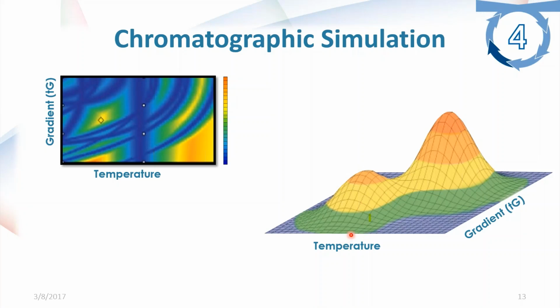Now, if you were doing method development in a linear fashion, so say we started at a particular temperature and we went up the gradient, you could find that, okay, now the separation's starting to improve, and you could optimize the temperature and end up in an area where there's a local maximum. However, the way the software works, by sampling the entire design space, it gives you the capability of identifying where the global maximum is simply by having a few experimental data points collected and then modeling the rest.